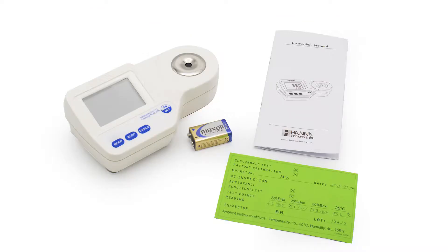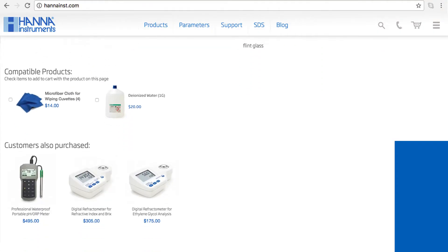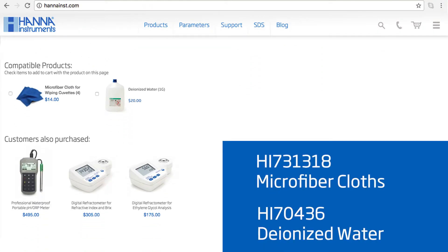Your meter includes one 9-volt battery and the instruction manual. I recommend you check out our compatible products on our website. For this meter, I recommend our HI-731318 microfiber cloths and HI-70436 deionized water.